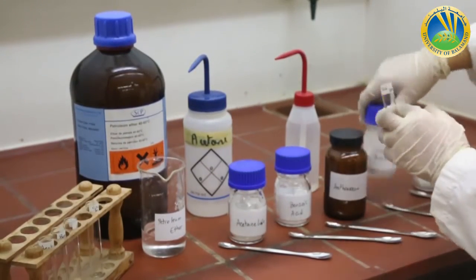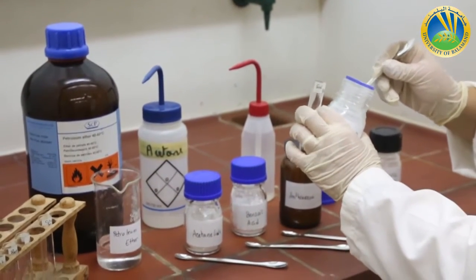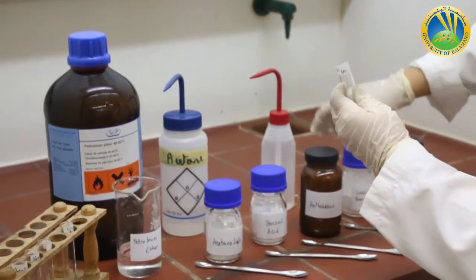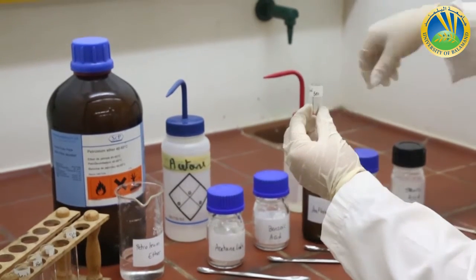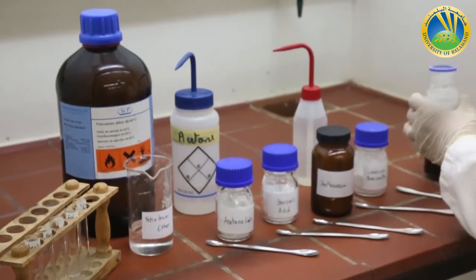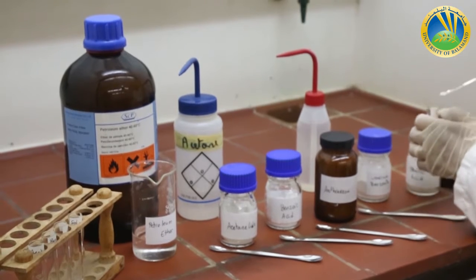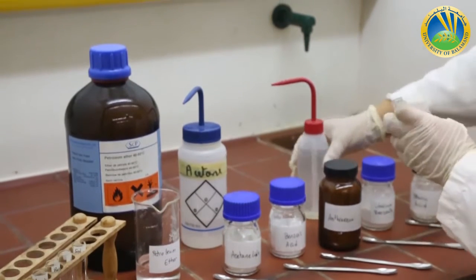Now it's the turn of sodium benzoate. Little amount, with water. Then stearic acid, with water again.